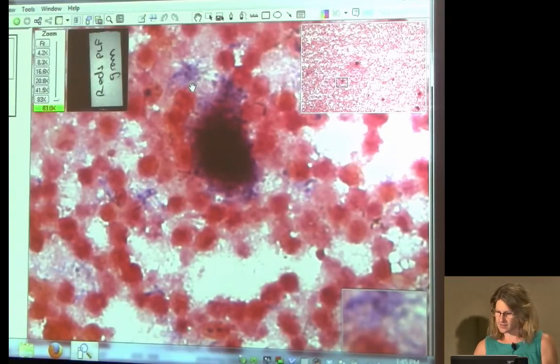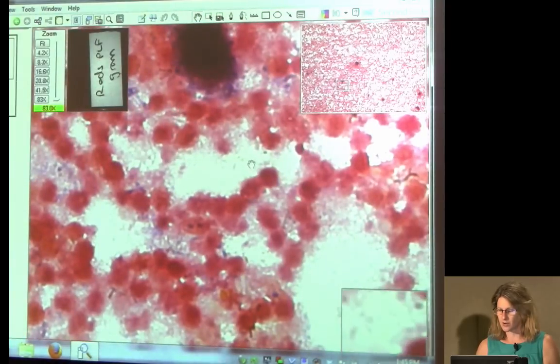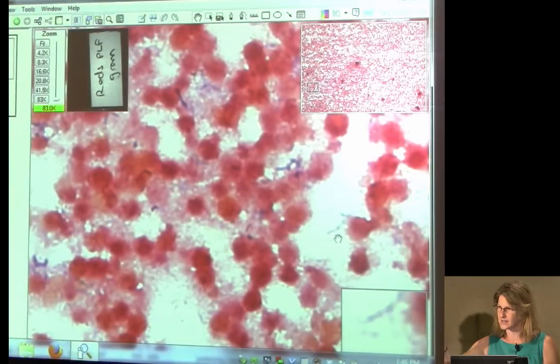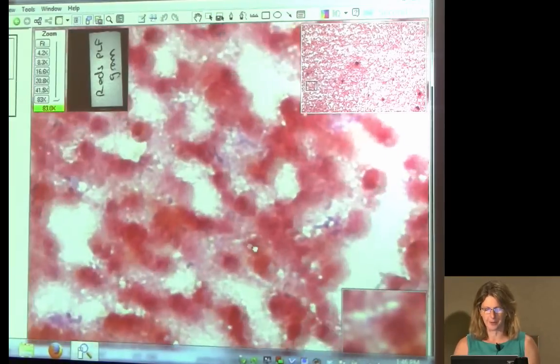Now, this is another thing about a gram stain that we don't like, is that in the background there are probably some gram-negative rods. I actually don't believe I'm seeing any in here. And it's really hard to see it. Now here's a beautiful beaded one. You can see the beading in that there's dark and light stained areas on this filamentous bacteria.